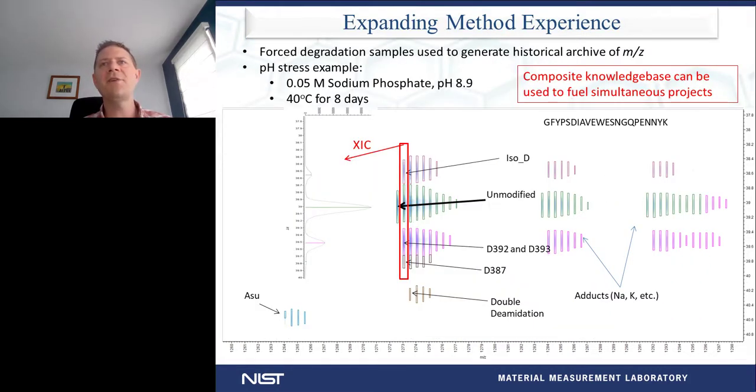So zooming a little bit closer in on one of those individual peaks, this is actually a peptide that we call the penny peptide. As you can see in the upper right-hand corner of this spectrum, the end residue spelled PENNY K, hence the name. But this is an important peptide because you'll see the Ns here are the asparagine residues, and each of these asparagine residues can deamidate. So this is that post-translational modification that I mentioned earlier that has the NH2 group going to an OH group. So what we see moving into this figure, the unmodified arrow points to the parent peptide. But when you have that NH2 to OH, you actually gain 1 Dalton in mass.